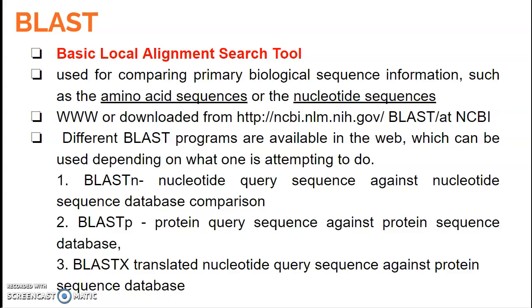Then next one is BLASTX. Here the query sequence I have is a translated nucleotide query sequence, that is, the result I get from a DNA. That translated sequence I'll be comparing with the protein sequence databases, because after translation it will be almost like a protein itself. So I'll be comparing it with already present protein sequences.